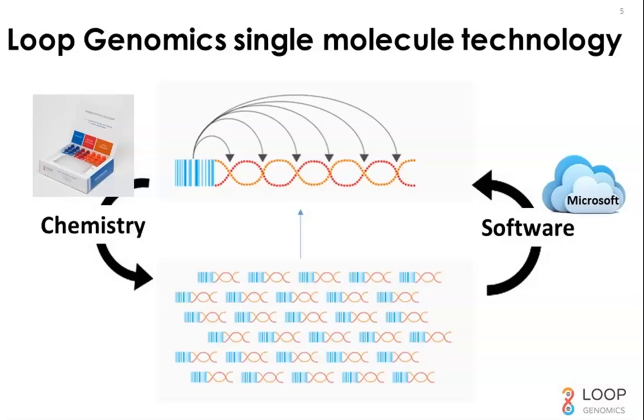But there are other long-read sequencing methods that can do 16S sequencing, for example those from PacBio or Oxford Nanopore. This wasn't really the subject of the webinar, where we're focused on comparing to short-read 16S sequencing, but we have done extensive studies comparing to long-read sequencing.